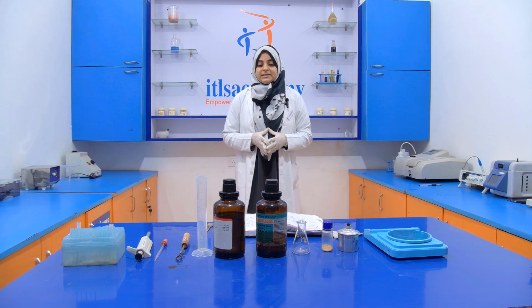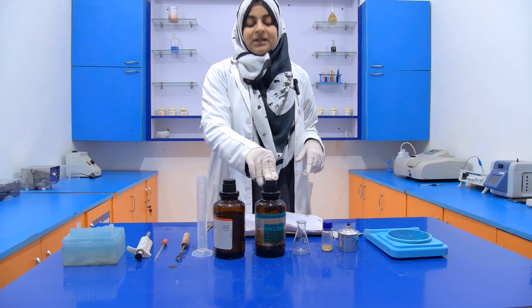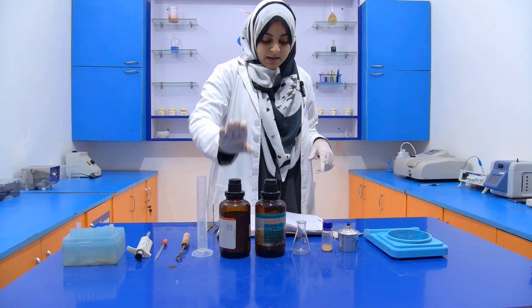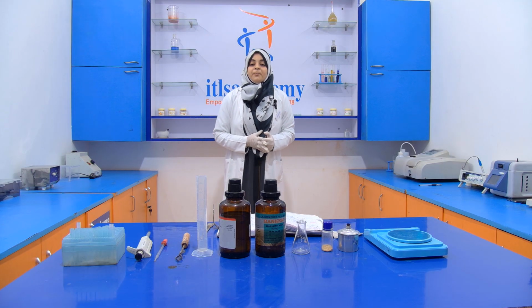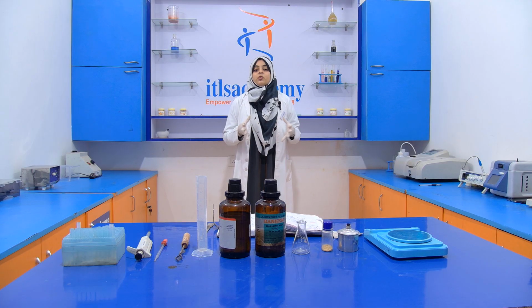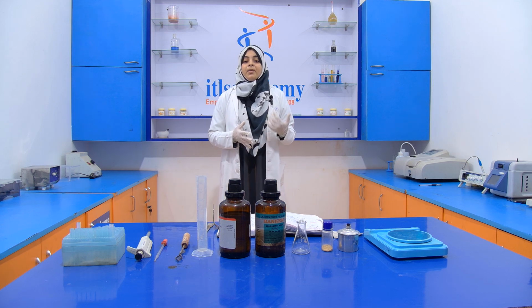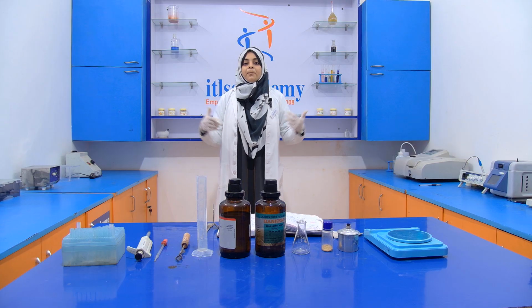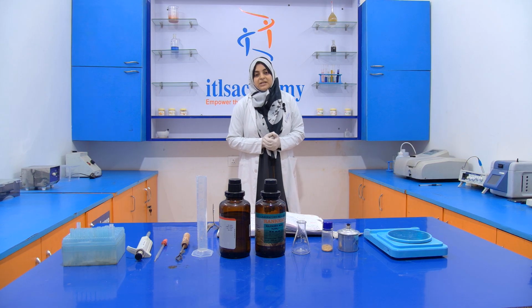So for performing this experiment, we require two chemicals. One is concentrated sulfuric acid and the other is acetic anhydride. When we are performing the experiment with concentrated acid, we have to take extra care. Here we are going to use concentrated sulfuric acid, so we have to wear a proper mask and a proper lab coat, and avoid direct contact with the concentrated sulfuric acid.